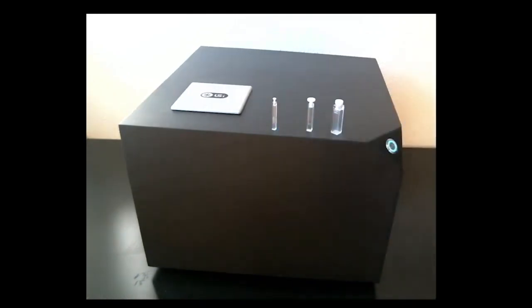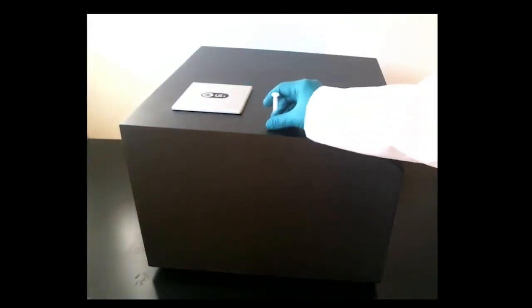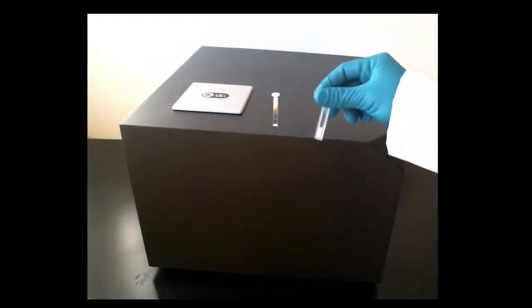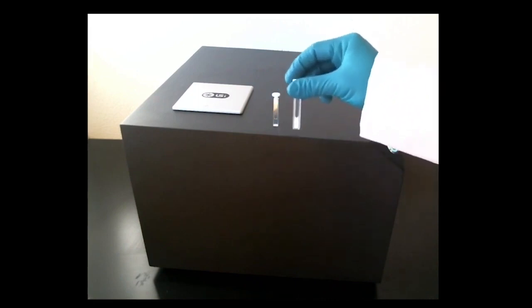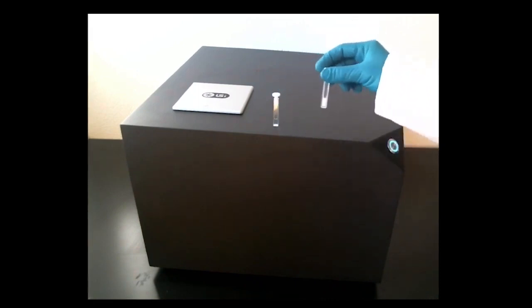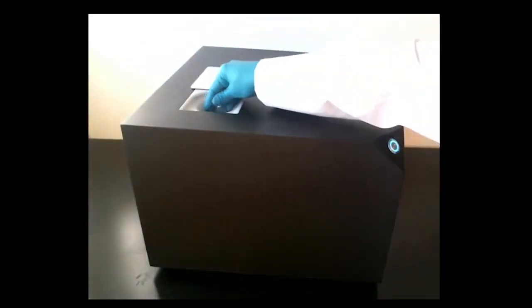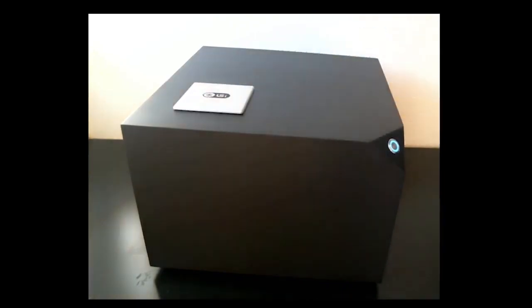And for the next part of this webinar, I will conduct a demo measurement on a BSA protein solution, which you can see in this cuvette. And since we're doing DLS microviscometry, I need to add particle tracers to this suspension. So now here on the screen, you see the protein solution loaded with polystyrene tracers. And so let's load this sample into the sample chamber. And I will now show you how to acquire a measurement on the NanoLab software.